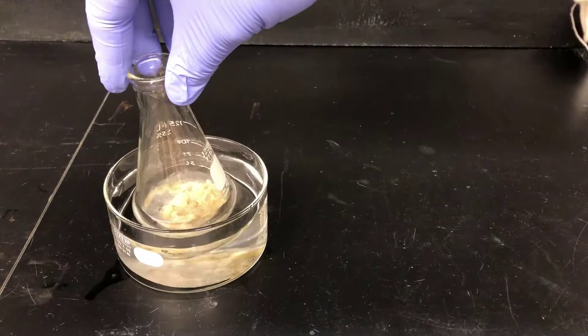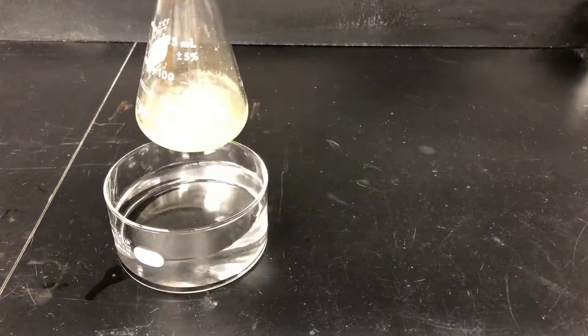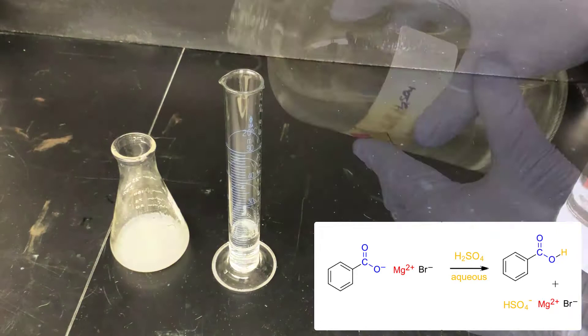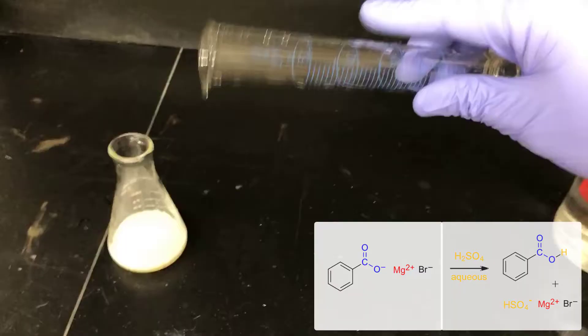Now there's a gooey tan blob at the bottom of the flask. That's the product at its current state. It's difficult to work with like this, so in the next step I'll add sulfuric acid, H2SO4, and water to protonate this carboxylate salt and make it neutral, which will allow me to work with it more easily. Here I'm adding 12 milliliters of 6-molar aqueous H2SO4 sulfuric acid in water.